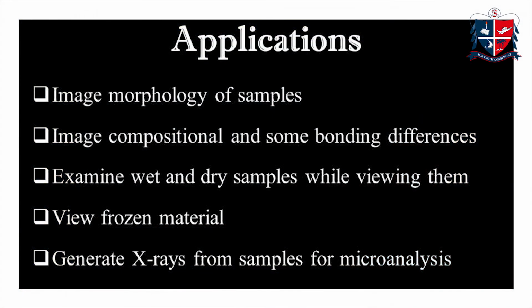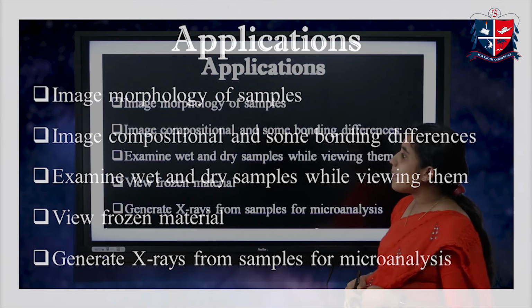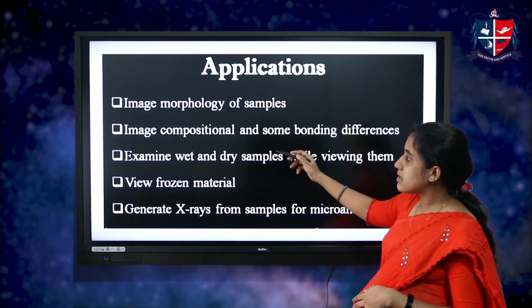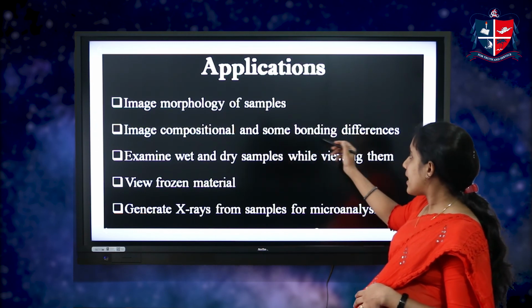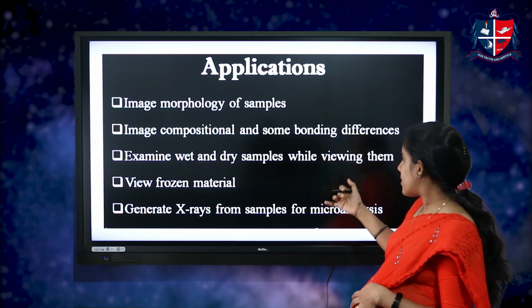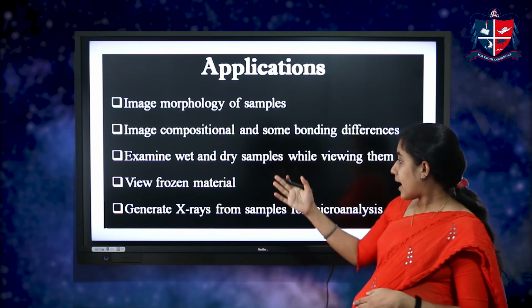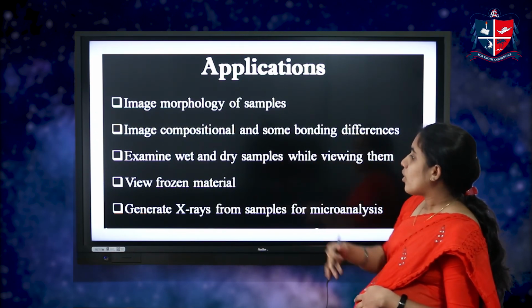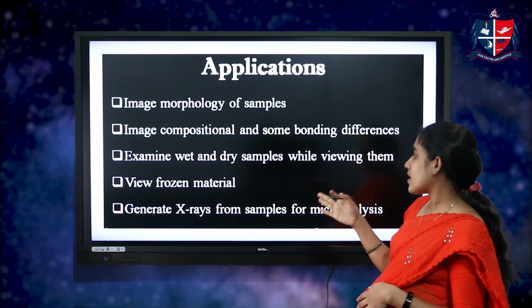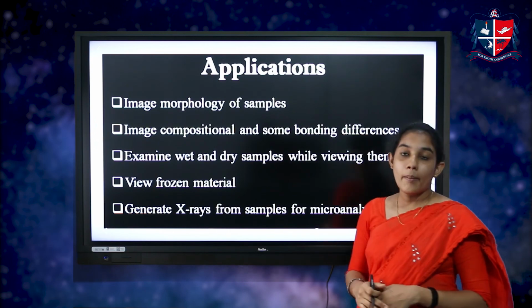Next are the applications. The first application is imaging the morphology of the sample. Second, imaging compositional and some bonding differences, and examining wet and dry samples while viewing them. The next is that we can view frozen material. And last is generating X-rays from the sample for microanalysis.